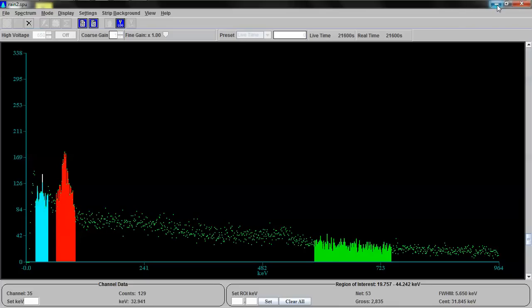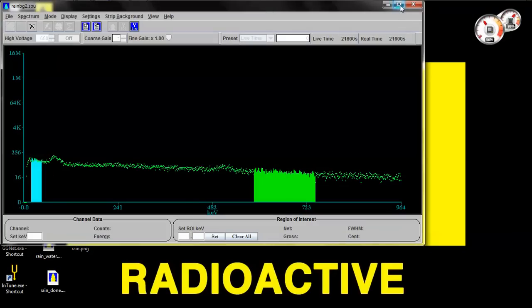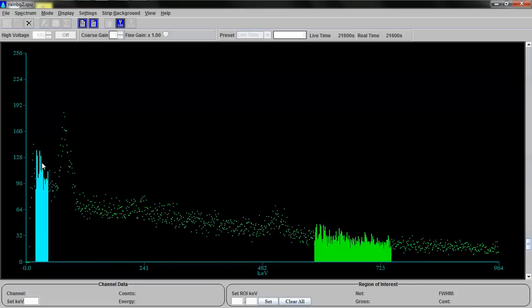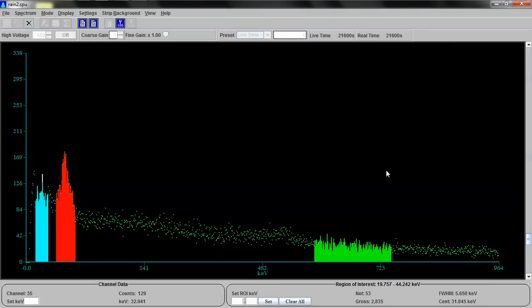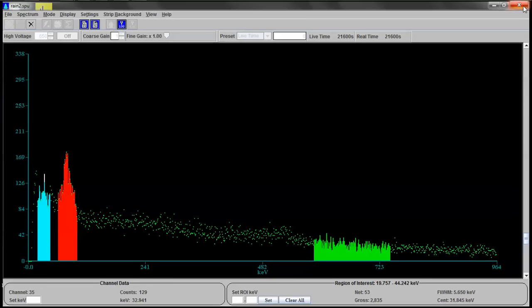Well, we took a background spectrum. This is a background with nothing in it but an empty detector. And during the background, you'll notice that there's that similar 32. It's almost 32, it's close. There's not a lot going on over here for cesium-137's area, just a little bit. So what you do is you take this sample and you remove this background from it. Both of these are 6-hour runs.